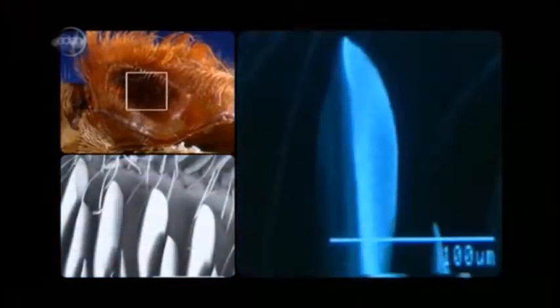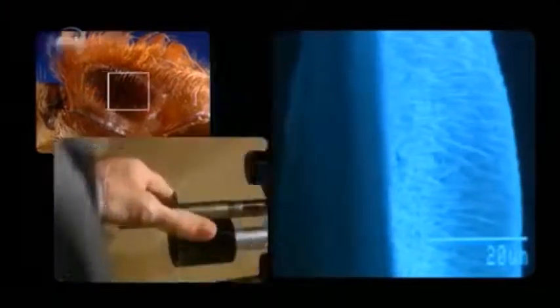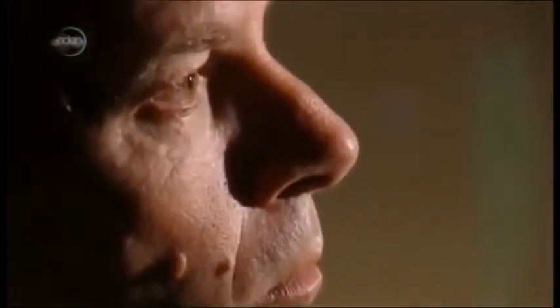We can see hairs within hairs within hairs. Even in some cases you can see bacteria stuck on the cuticle. The shape of the hair tells much about its role, whether it's for food filtering or measuring temperature. Scanning allows Dr. Raven to build up a dictionary of characters, and put together they determine the spider's family tree.